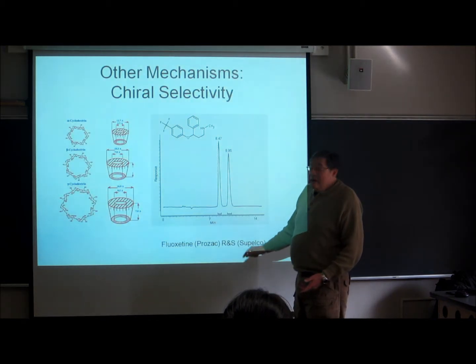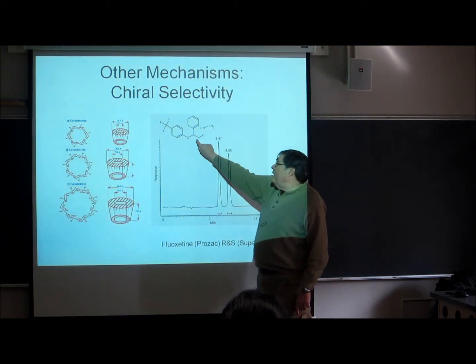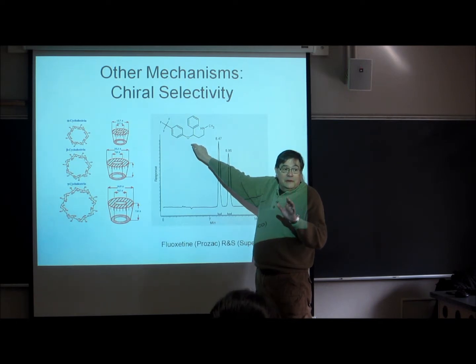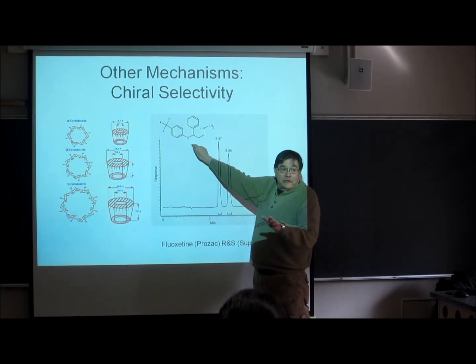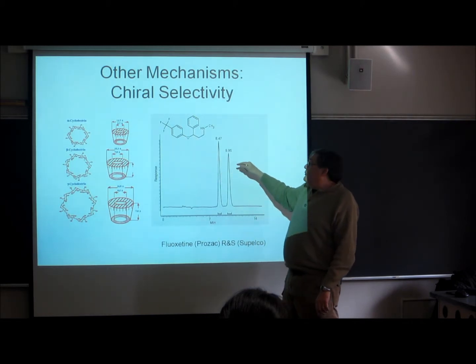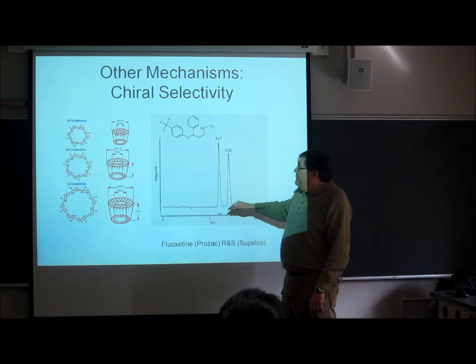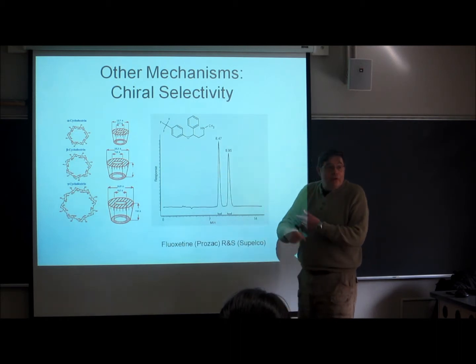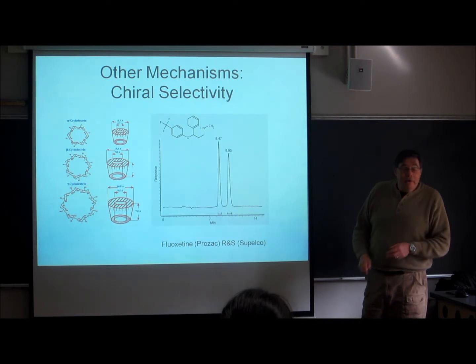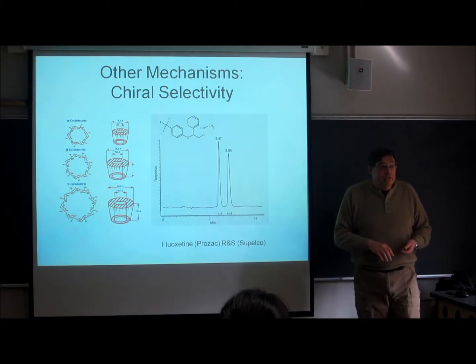So you need to find a way to synthesize only the R or only the S isomer, and that's where Tom Hoye and the organic chemists come in, because they learn more and more about how to do the specific stereochemical synthesis. If you synthesize both of them, you have to use some preparative chromatography method to separate them before you put them into a pill so that you have them in the right form. Right? This is a very important use of preparative LC in industry. Extremely important.